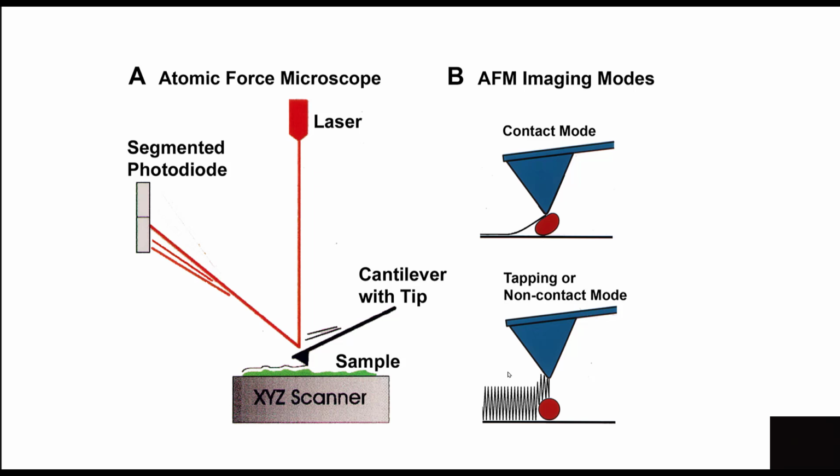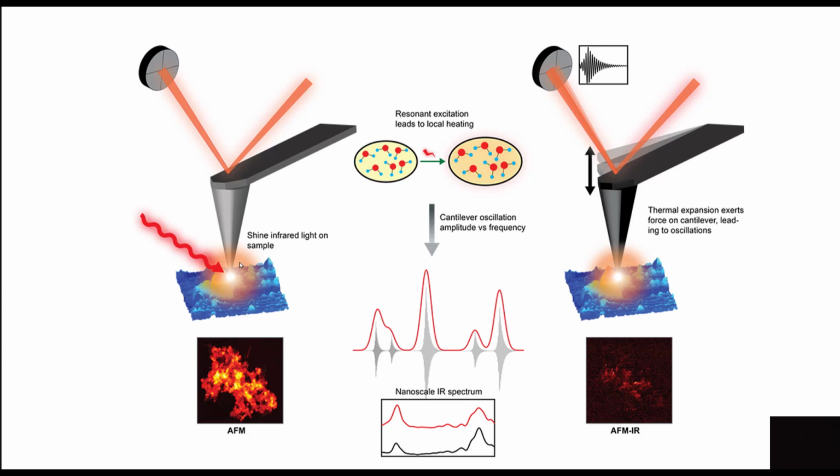And you start dragging that over your sample. Now the laser comes down and hits that cantilever, and if it's moving as it goes over the terrain, it catches that pitch, and then that goes to the detection system and represents the sample that you're trying to look at. And that allows you, the resolution is now that point that's attached to the cantilever. So that's usually 1 angstrom thick.